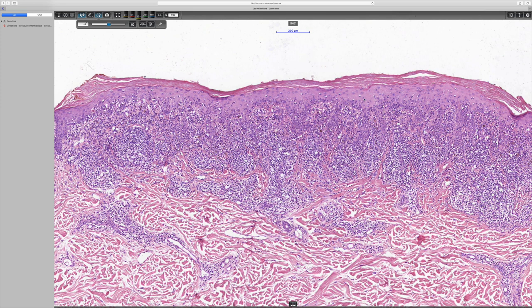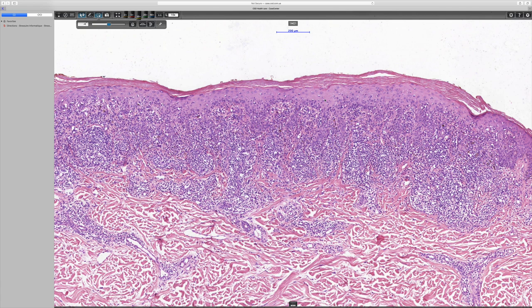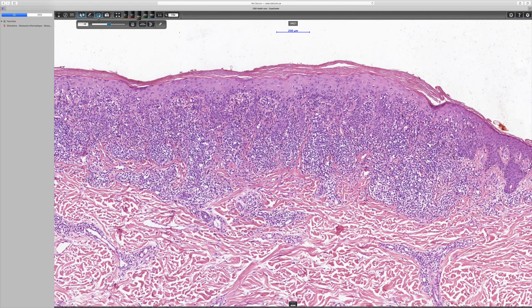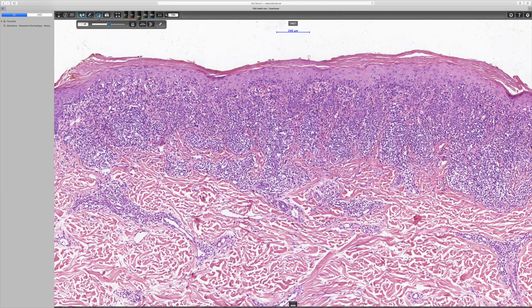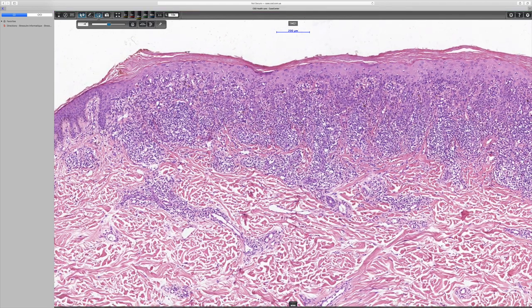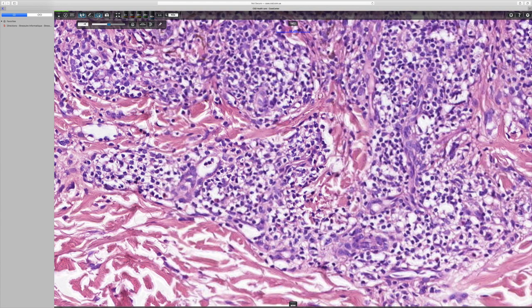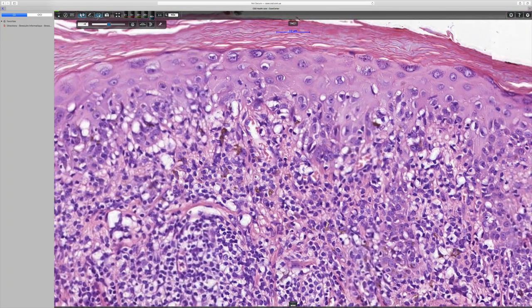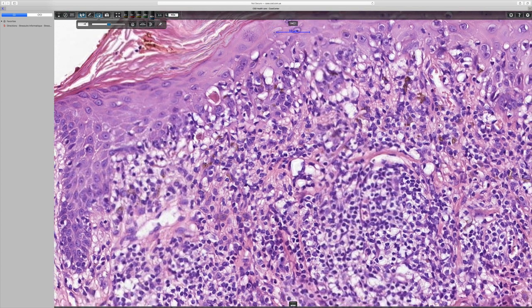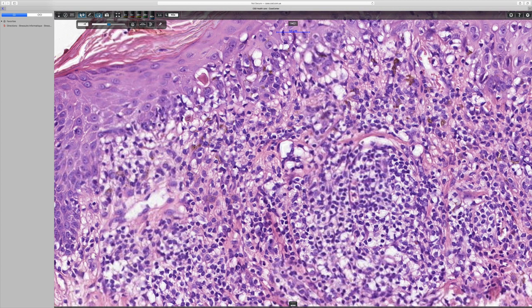Some people believe that lichenoid keratosis represents a sort of regression in a lentigo, and this lentiginous hyperplasia might go along with that diagnosis in this particular case. Looking further, there is very marked interface change affecting nearly all of the lesion. Even at this magnification we can see a cytoid body, and at full magnification here is another cytoid body — and that's probably a rather defunct one there.